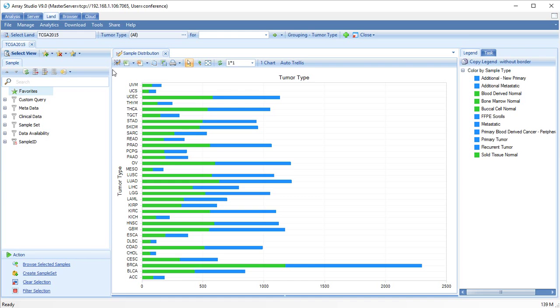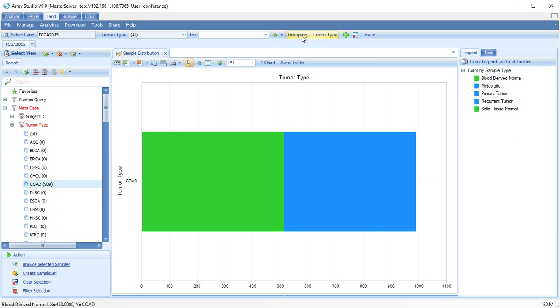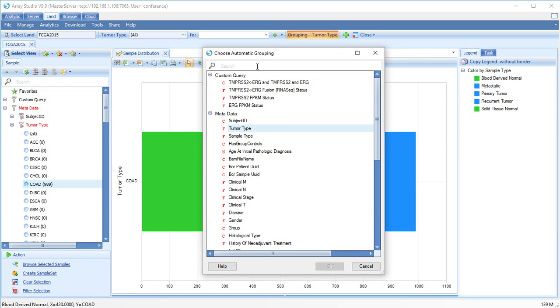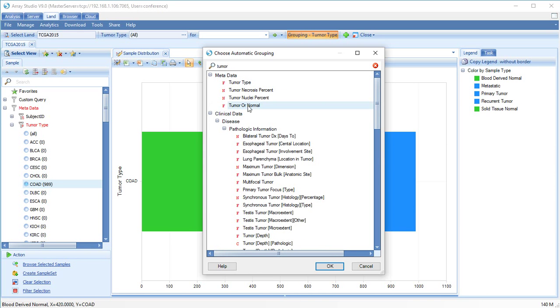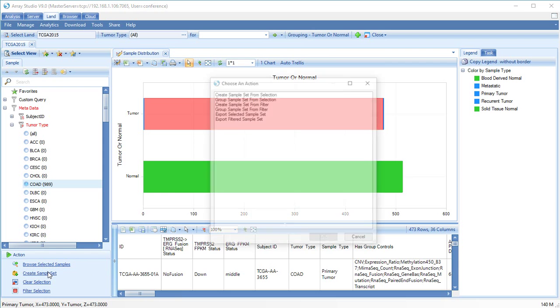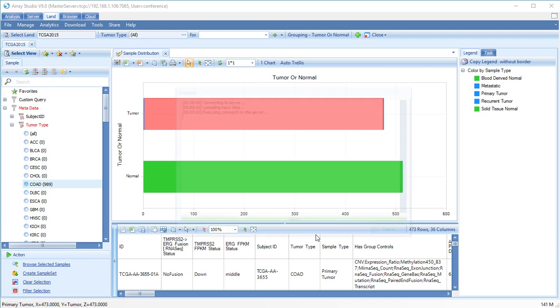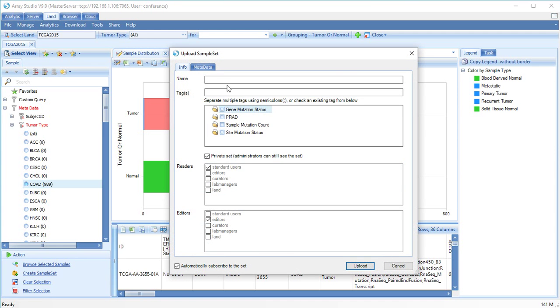First, we will create a sample set of these samples. Filter for COAD. Change the grouping to tumor or normal. Select the tumor samples and click Create Sample Set, Group Sample Set from Selection.